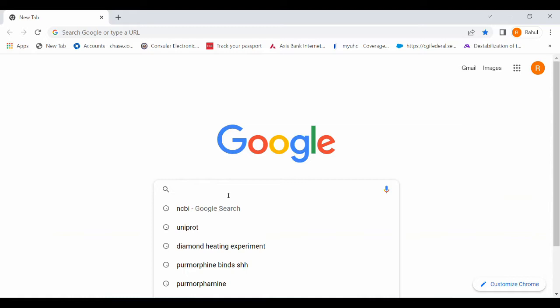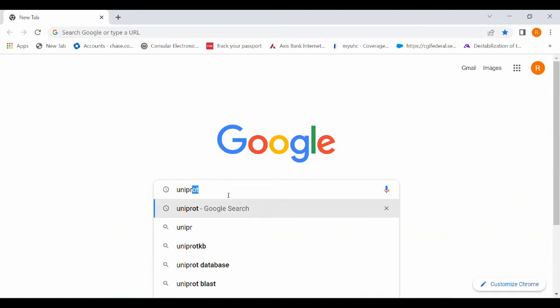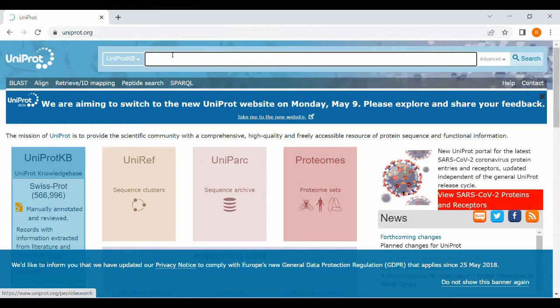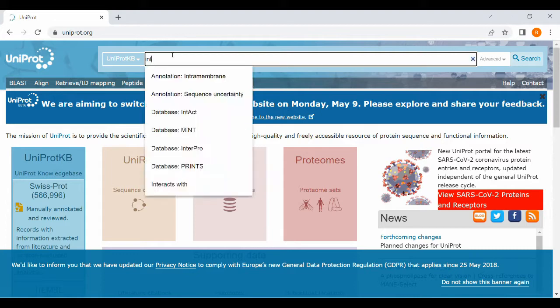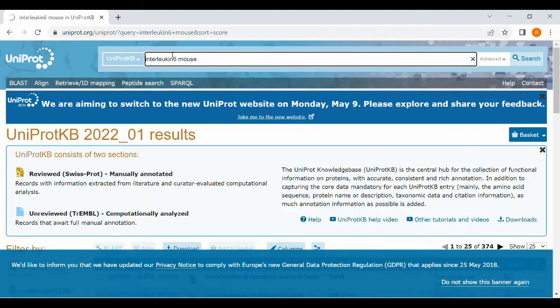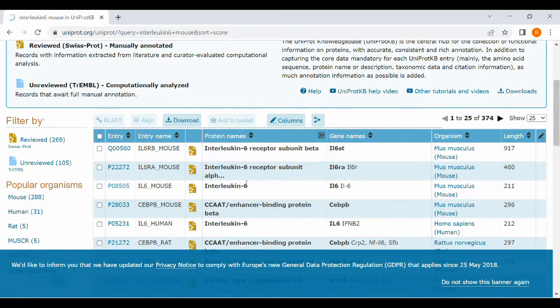There is one more method to find out gene sequence. You will go to Uniprot. Type Uniprot in Google and give a search. Click onto the Uniprot and type whatever gene you want to find. Here I am again typing interleukin-6 mouse. Click on and give a search.